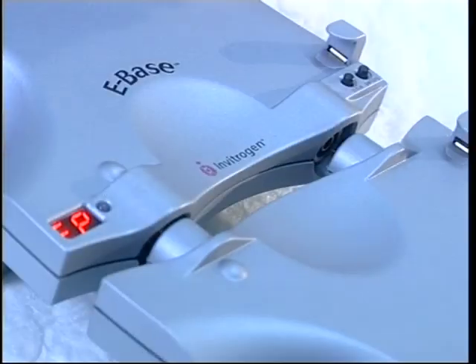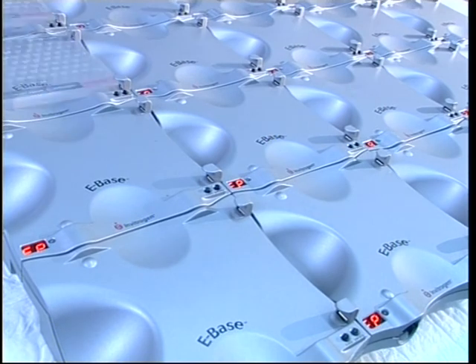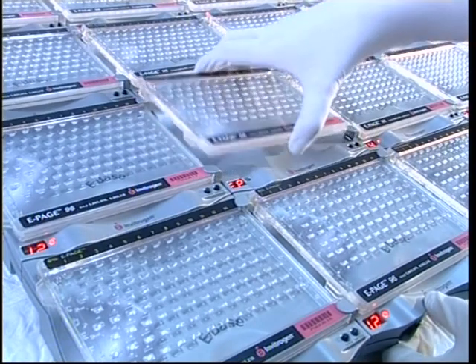Mother and daughter eBase units are connected together but still operate independently. This feature allows you to run dozens of experiments simultaneously. Removing any gel would not affect running the others.